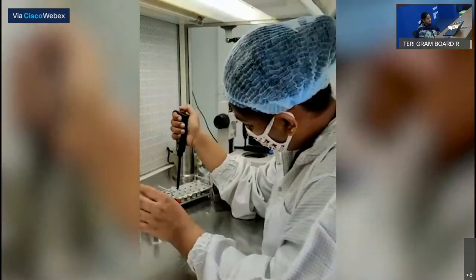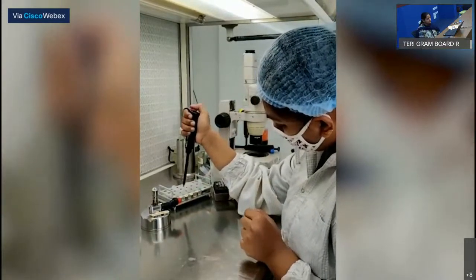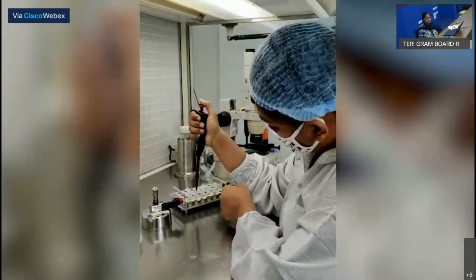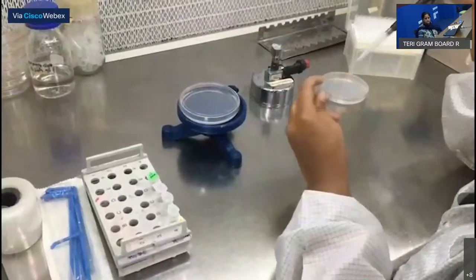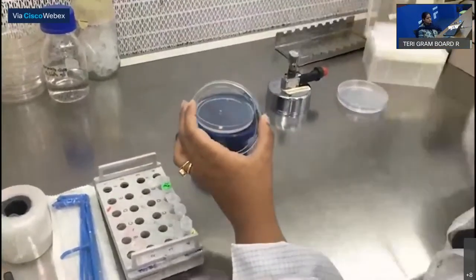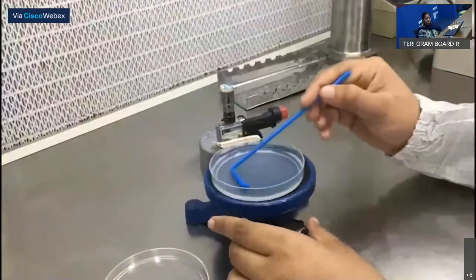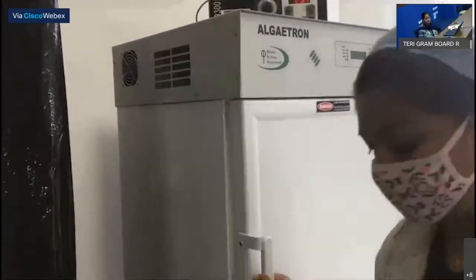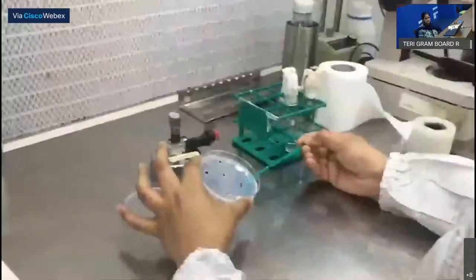After 7 to 10 days, when the growth appears, the cultures are serially diluted up to 10 to the power 5 and 6 dilution in order to get pure colonies free of other contaminants. Further, the 10 to the power 5 and 6 dilutions are plated on agar plates of specific media and kept under controlled conditions in an Algatron incubator at 120 micro-Einstein per meter square per second of light intensity, 25 degrees Celsius temperature, 16:8 hours photoperiod until the colony appears.